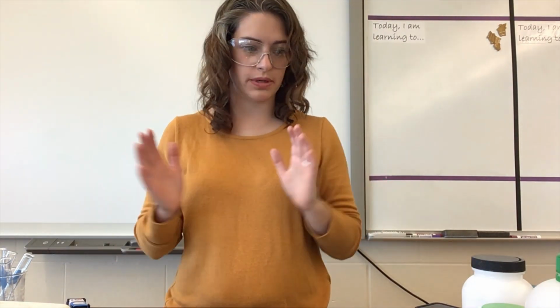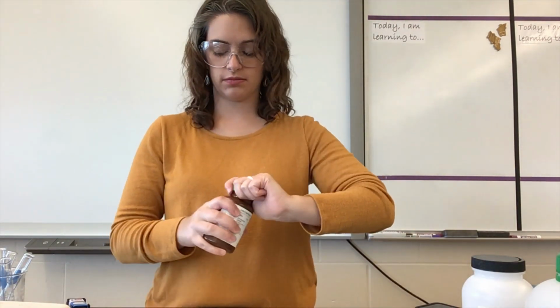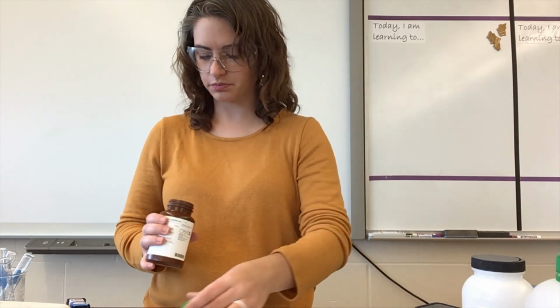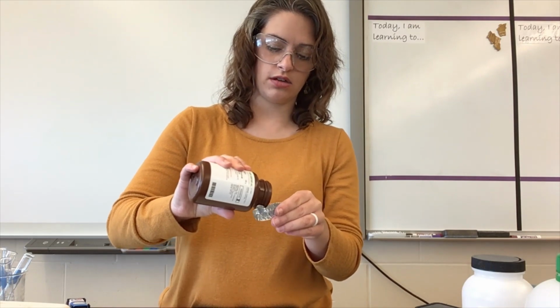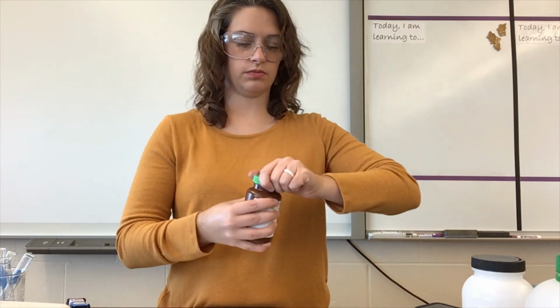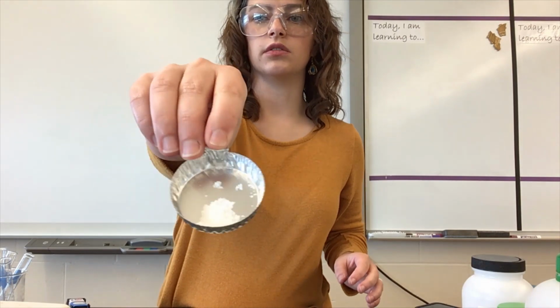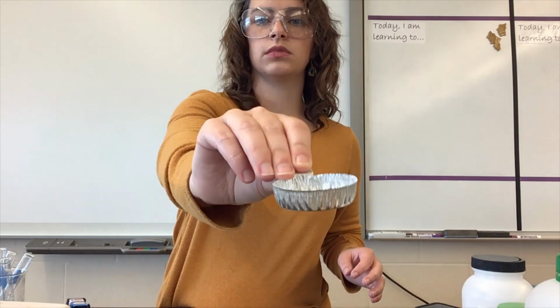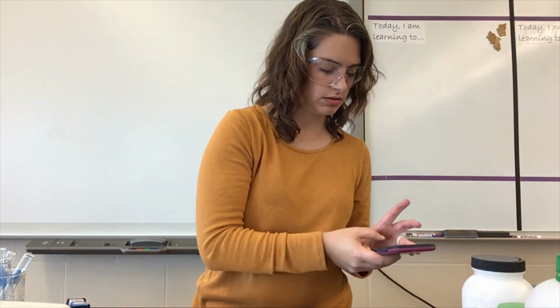Okay, 2 more to go. Potassium iodide is our next one. So that's this guy. Give it a shake because it's a little solid on the inside. Okay, pour some into my weigh boat. There you go. And just like all the other ones, I'll add the picture.